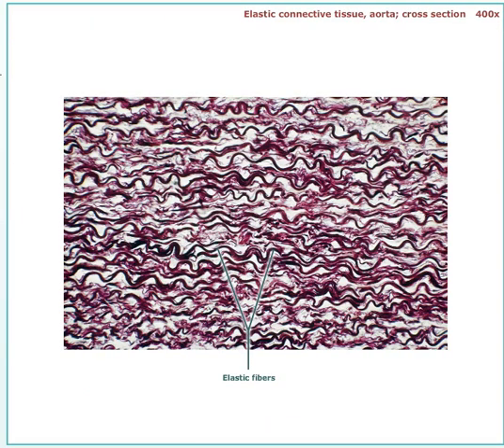Here's elastic connective tissue. Most of the slides I see kind of stay in this color, so this is actually a pretty common dye pattern, but with the elastic, it has this wavy, almost kinky, coily pattern to it. That's telltale for elastic connective tissue. And this one here is shown in the aorta, and this falls into the dense connective tissue family, okay?